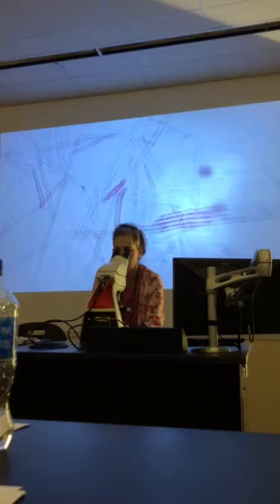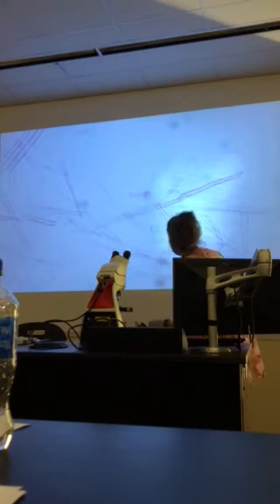And my Pinus australis, narrow ones. So here's my Pinus australis. Find a really good example of one. That's a really good tracheid right here. That's a tracheid right here with lots of tiny openings.